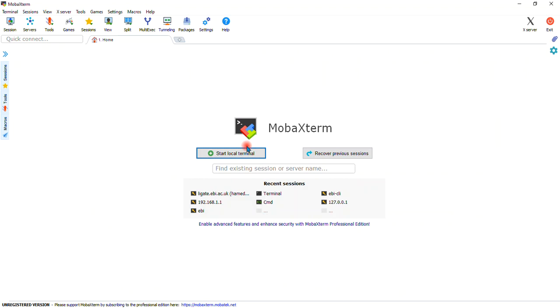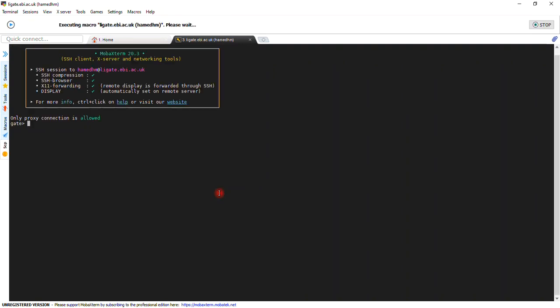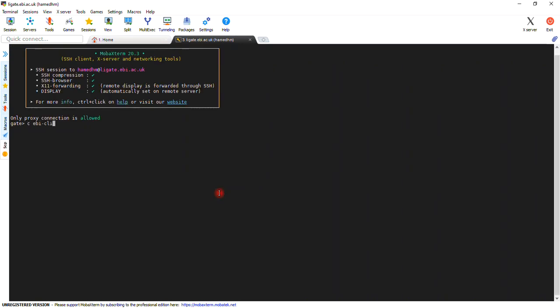The first step is to access the IMPC cluster computing LSF. So we use the Yoda cluster in the IMPC.